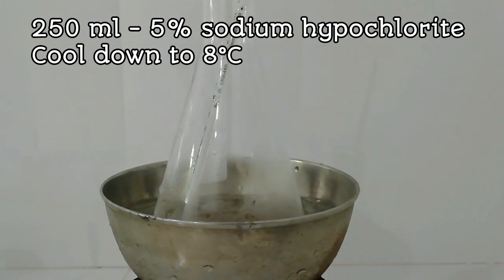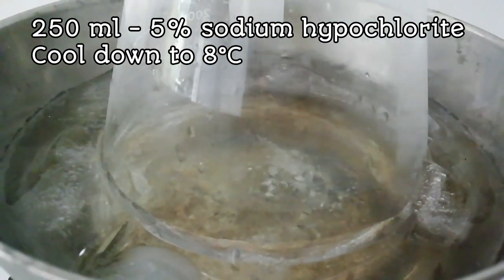First, 250 ml of 5% sodium hypochlorite solution is cooled to 8 degrees Celsius.